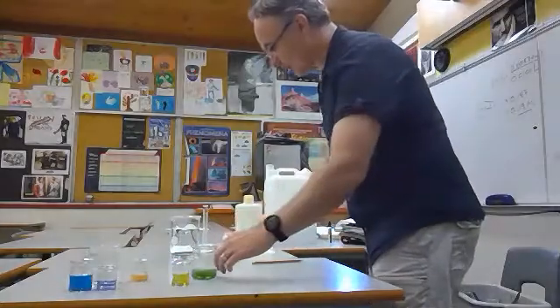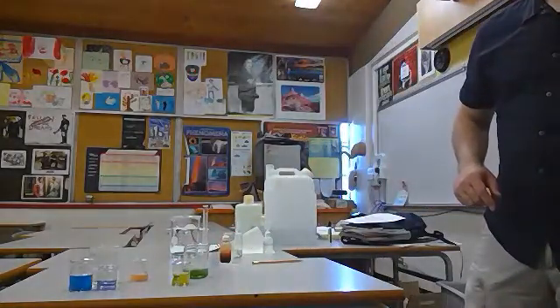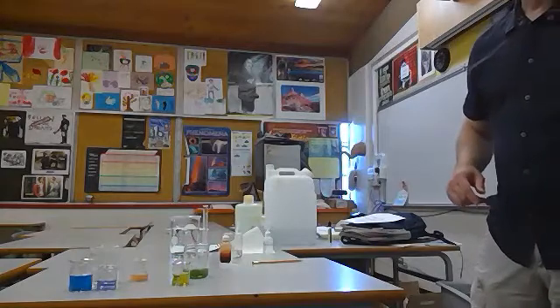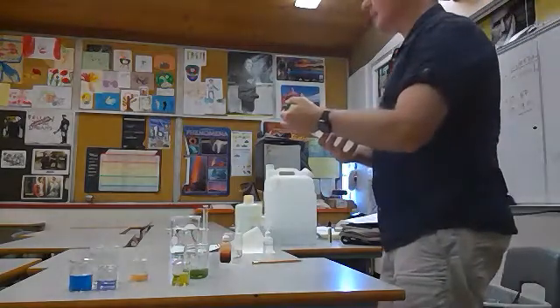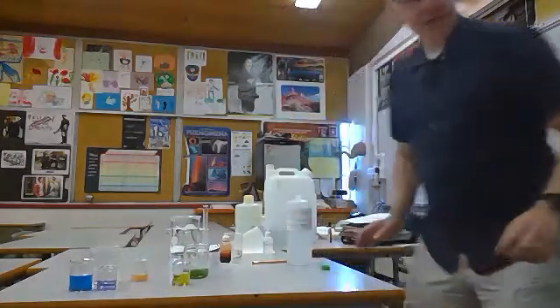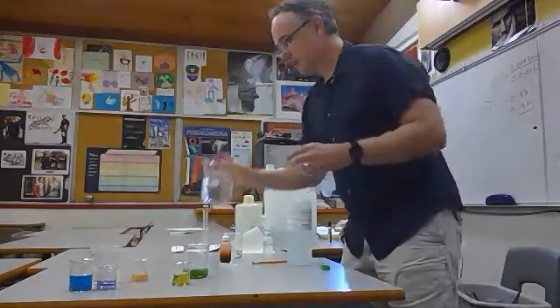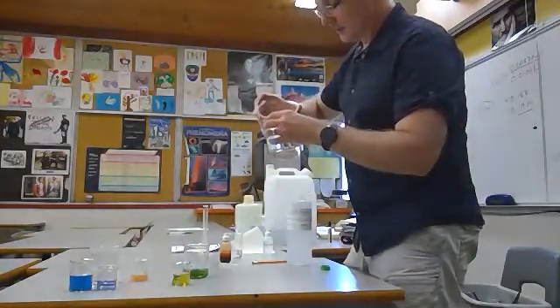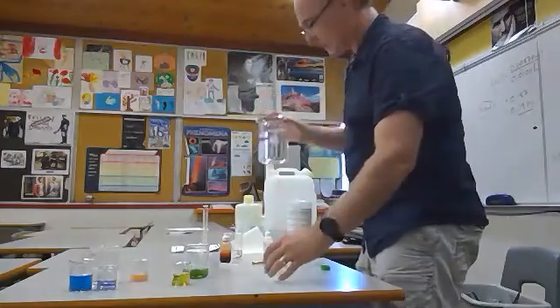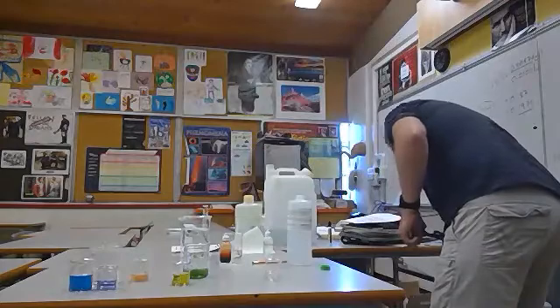So let's take a look at our buffer here. This is a buffer. This chemical is buffered at pH 7, so it tries to resist pH changes at 7. What I'm going to use as a control is just regular tap water. And I'll use another beaker for my buffer solution.